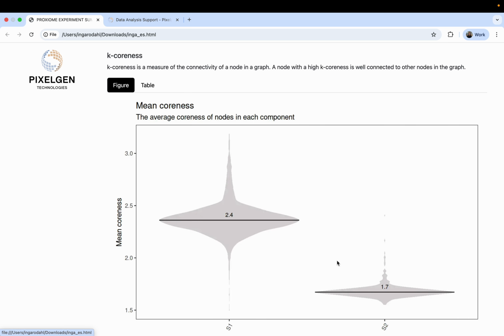Now the last quality metric is our control markers. In our panel we have 3 isotype controls, and this is showing the amount of reads that have been allocated to these markers. Both of our samples seem to be at good quality, with well below 0.1%, indicating that the cells have a good quality. So overall, from these quality metrics, we now know that our cells have good quality and they have been sequenced just enough.